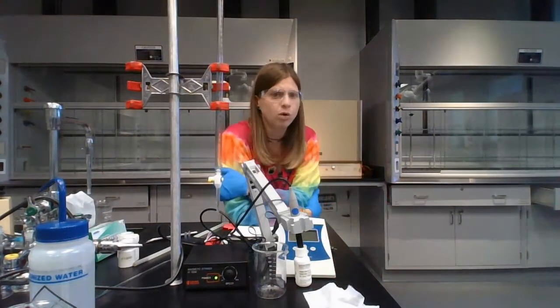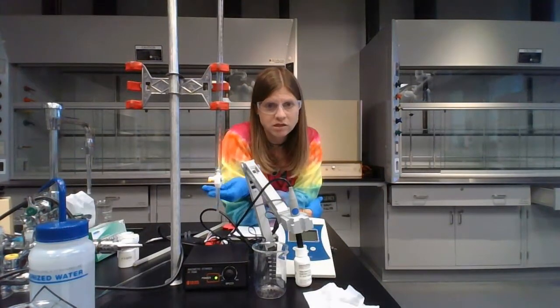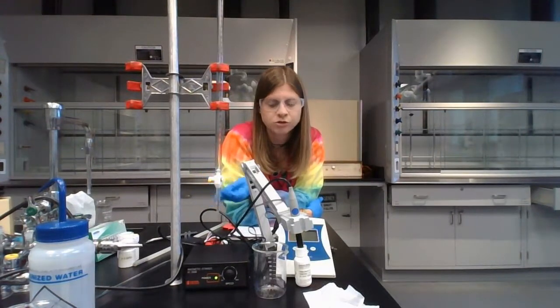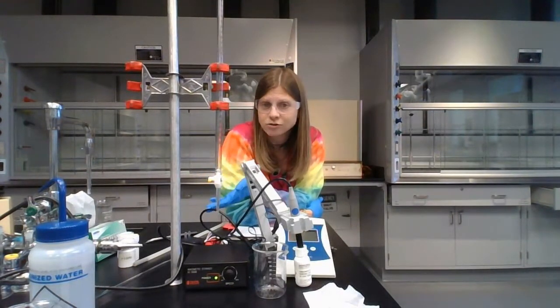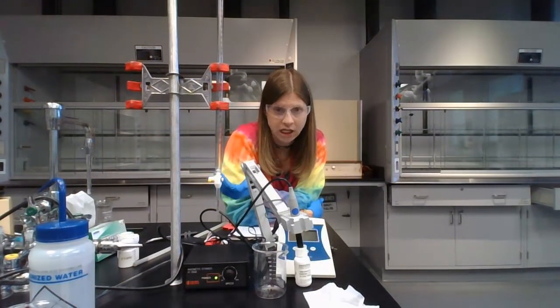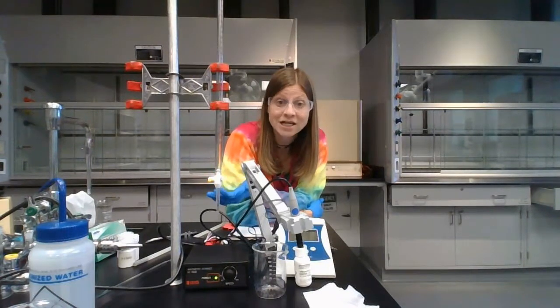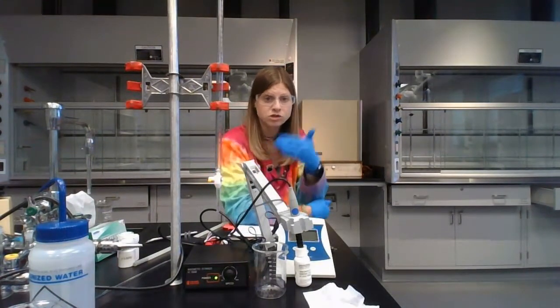In trial 1, our equivalence point, or our end point if we were using an indicator, would have been when the solution changed color. Our solution in trial 1 did not change color. But at some point, you are going to have 2 data values where the pH jumped significantly, not by 0.2 or something, but by 4 or 5 or 6 pH values, between those 2 measurements.